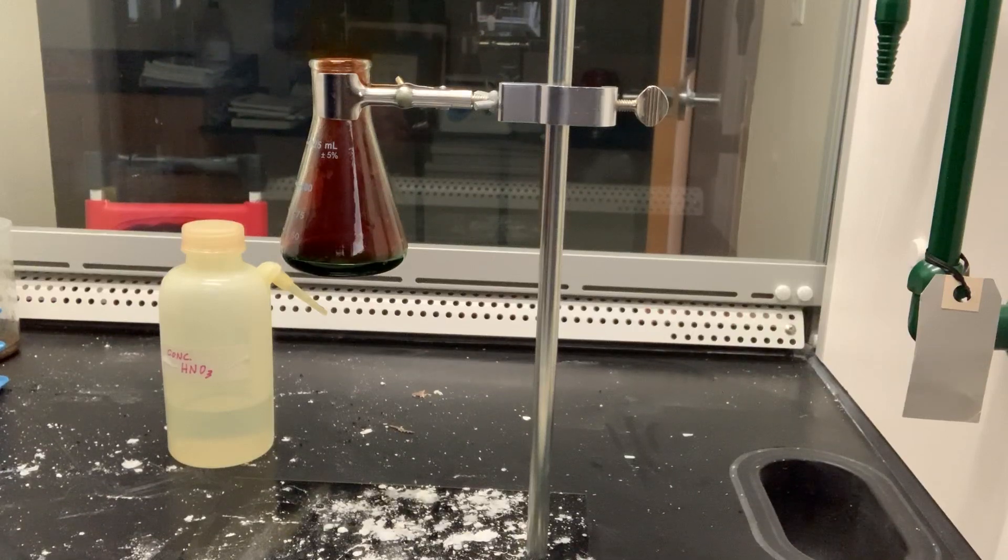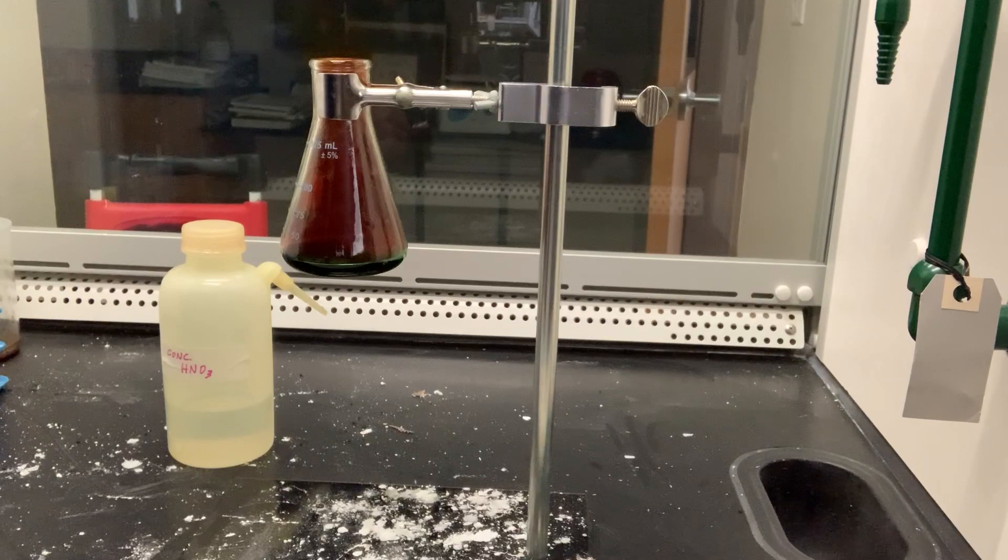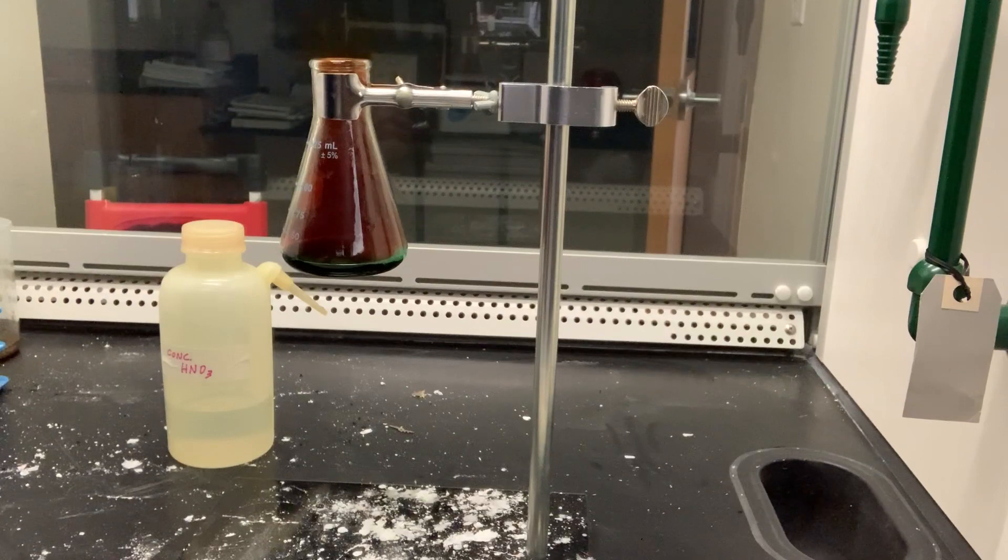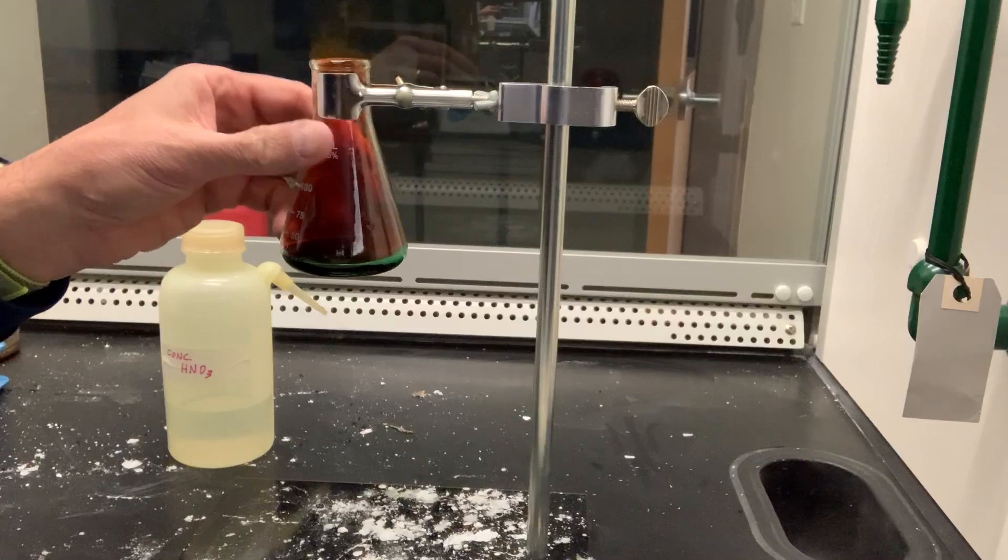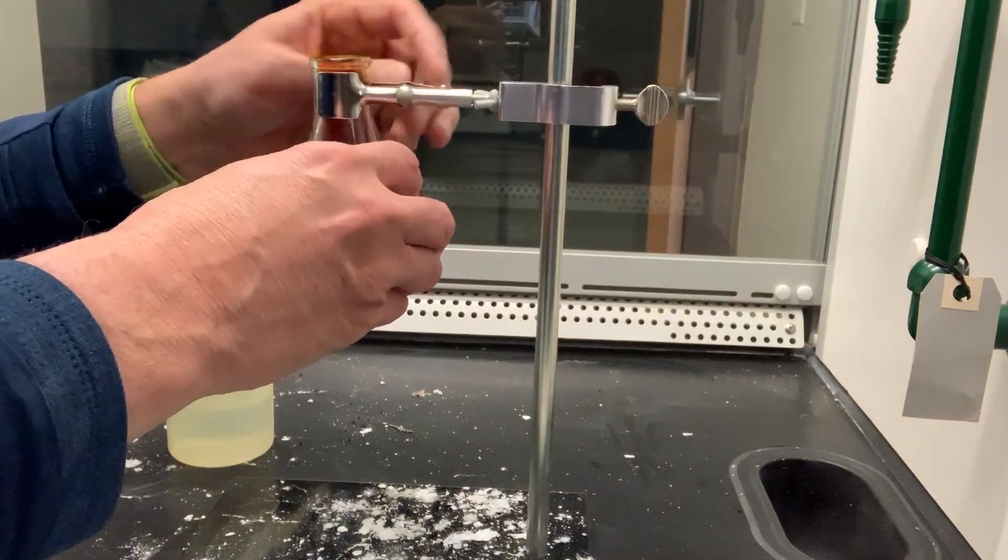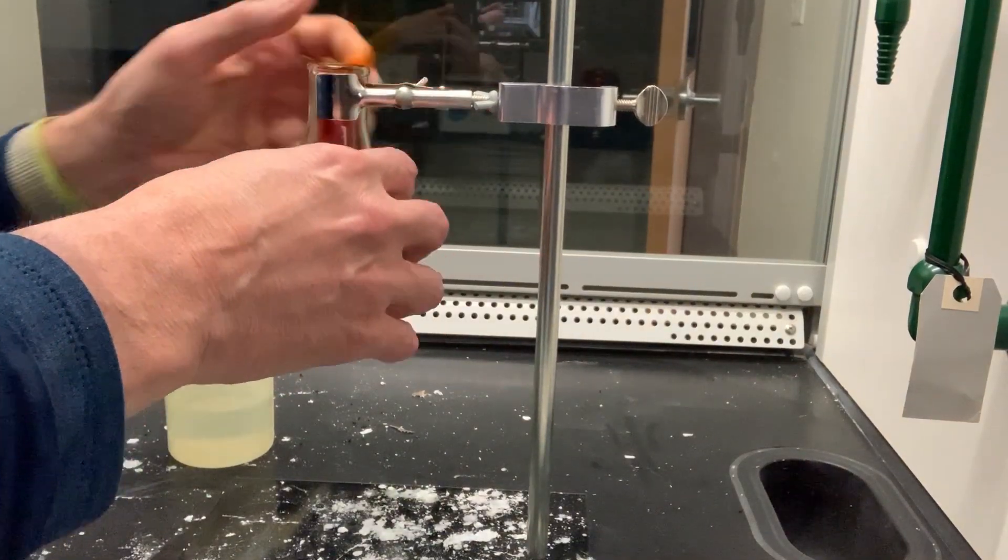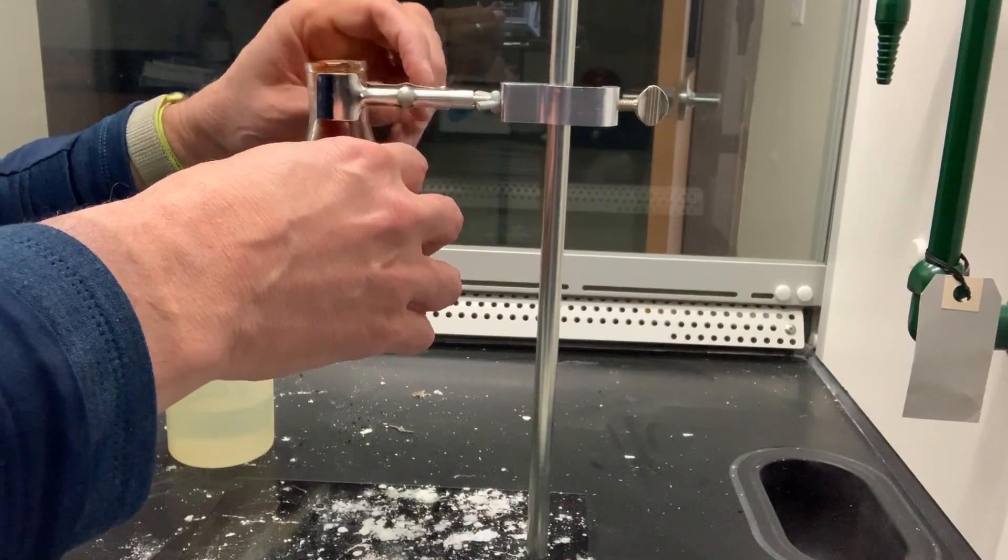Close quote. The reddish-orange gas that was produced is nitrogen dioxide, a very toxic gas. That's why we're using the fume hood today.